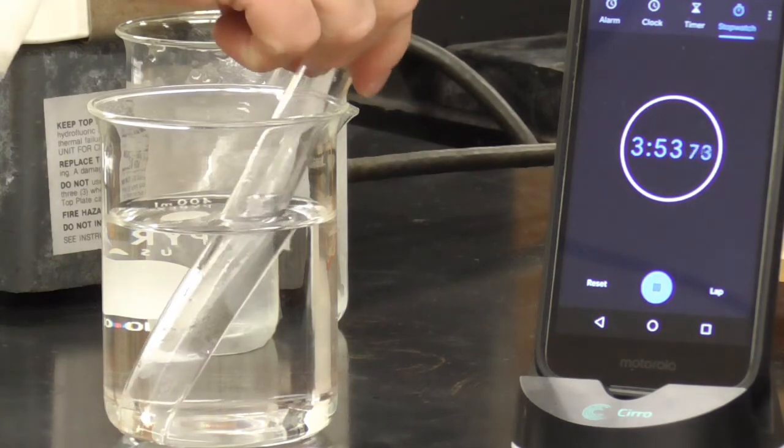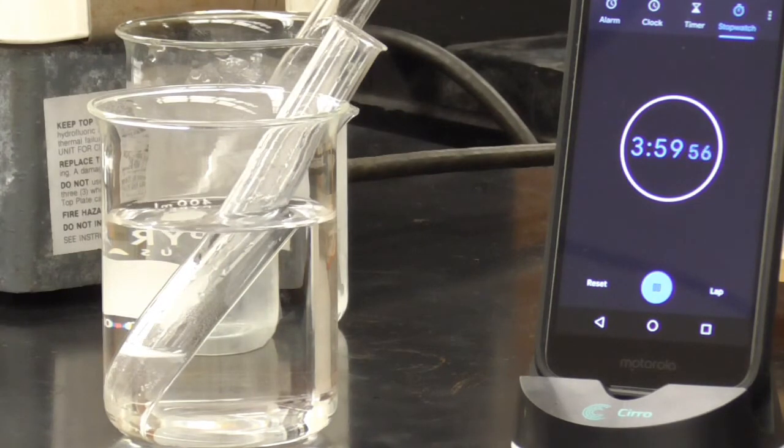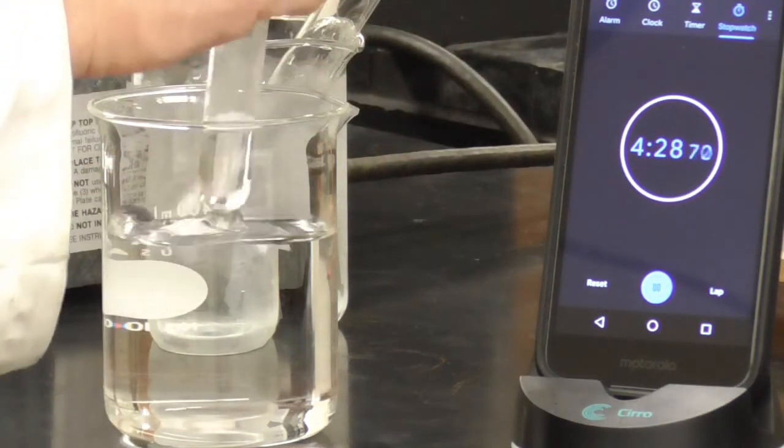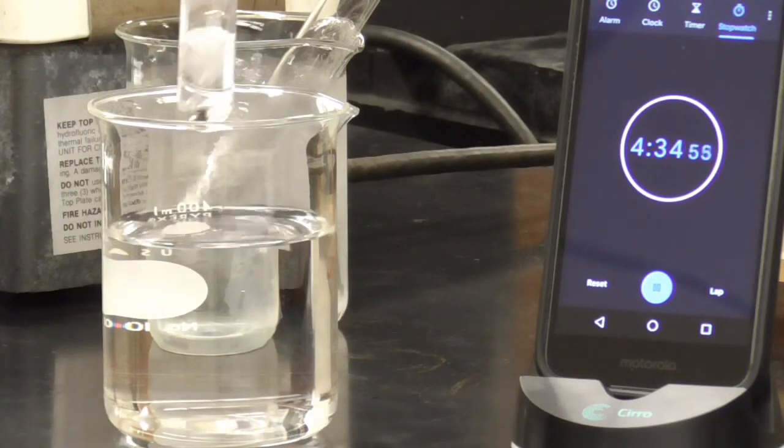Going to stir it up here a little bit. It's almost there. A little bit of bubbles still coming out. Just barely. Seeing almost, right? Almost gone. I can still see a little bit of that metal.